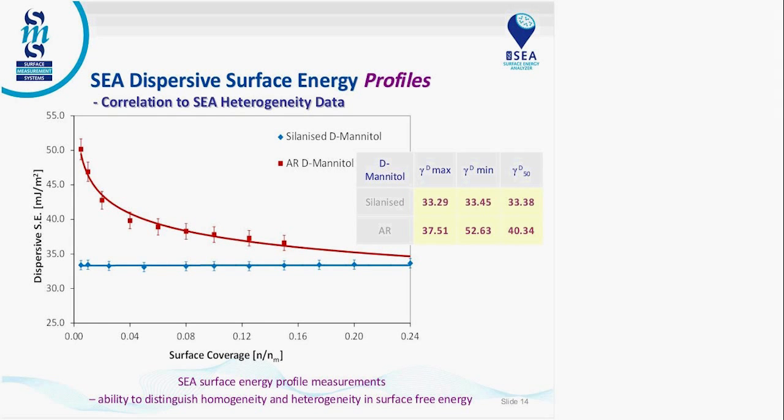So you have a question. For our method, we would always require you to either know the surface area by measuring it by inverse GC, or from nitrogen data. We require you to enter the surface area before doing any experiments, because we want to make sure that you compare values at the same surface coverage when you want to compare different samples. There's another question. We do require the BET surface area, either from our instrument or from another instrument, before you measure the surface energy.